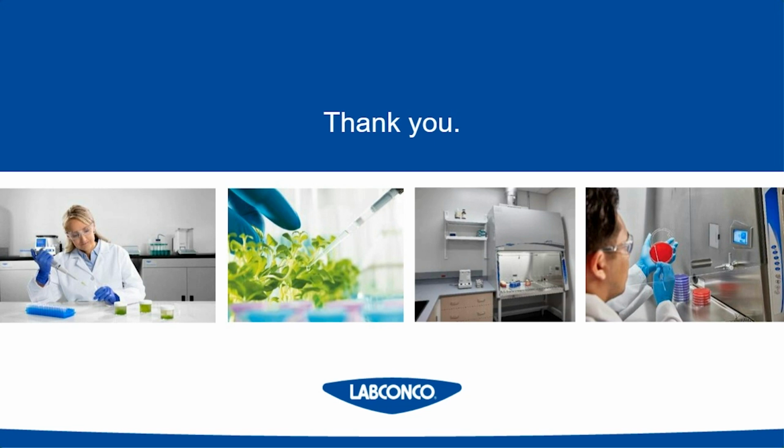And remember, in an A2, some of that chemical is going to be recirculated in the cabinet versus being directly exhausted like it would in a B2 or a C1. So really knowing how much of your chemical is volatilizing, how much is in the air, is going to help with your determination of whether an A2 is going to work or if you require a B2 or a C1.